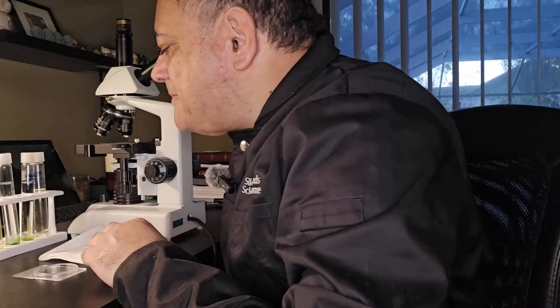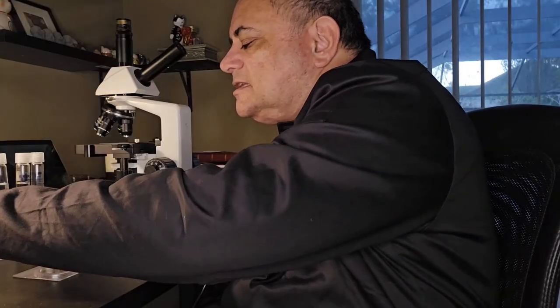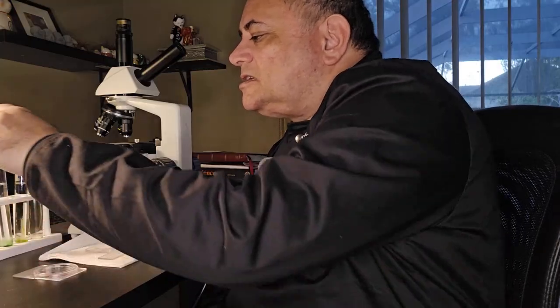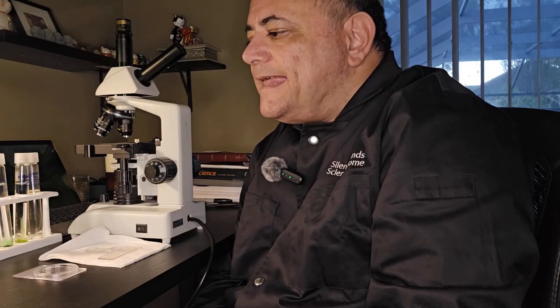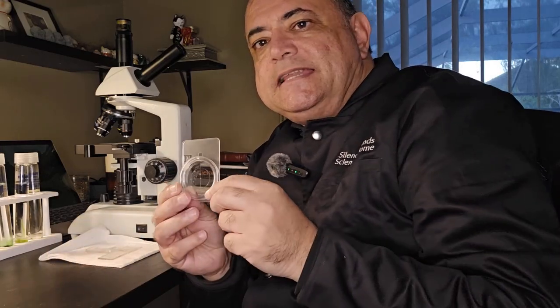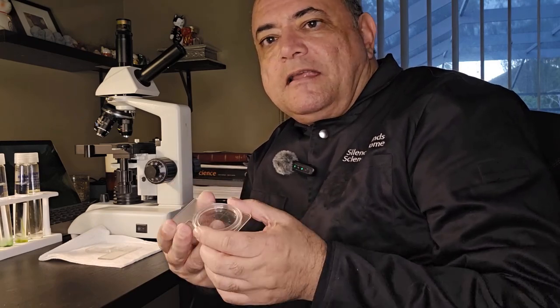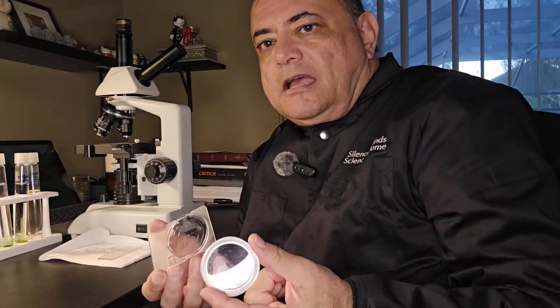Okay, so I'm at my microscope station now, and I've got some cultures of the different algae that I just discussed. Typically when I'm looking at microorganisms under a microscope, there's a couple of ways I look at them. First is using these, what we call Petri slides. They look like little Petri dishes.